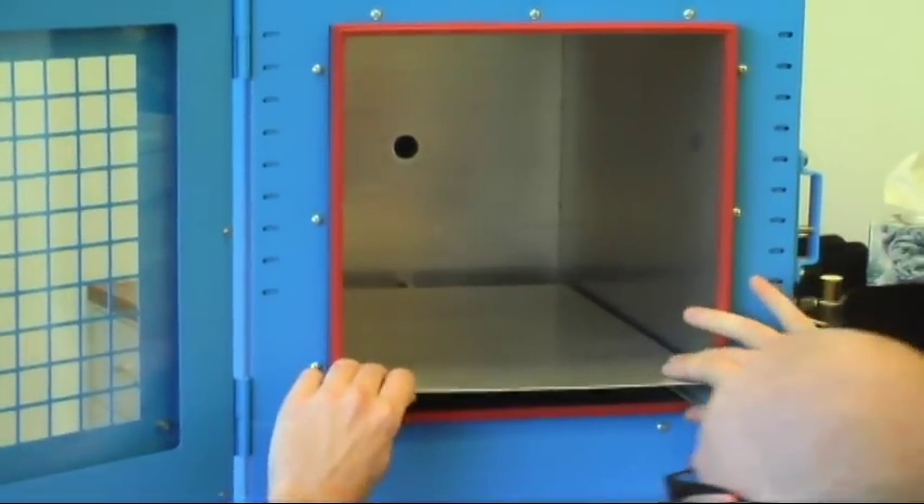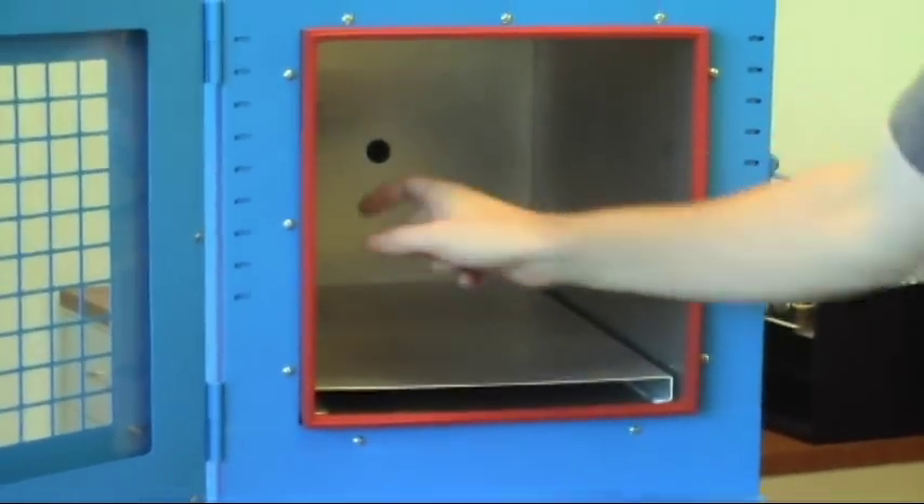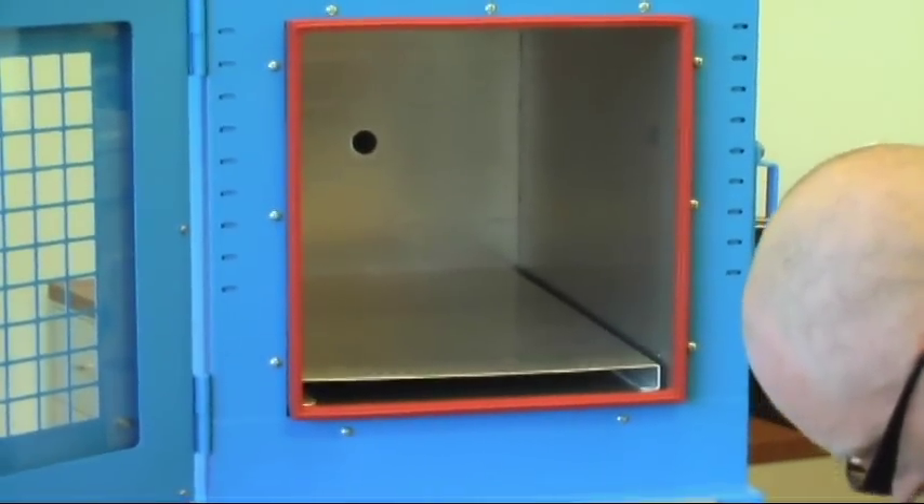Sometimes it's easy, sometimes it's not. There we go — it slides right in. It detaches. We have two more shelves.